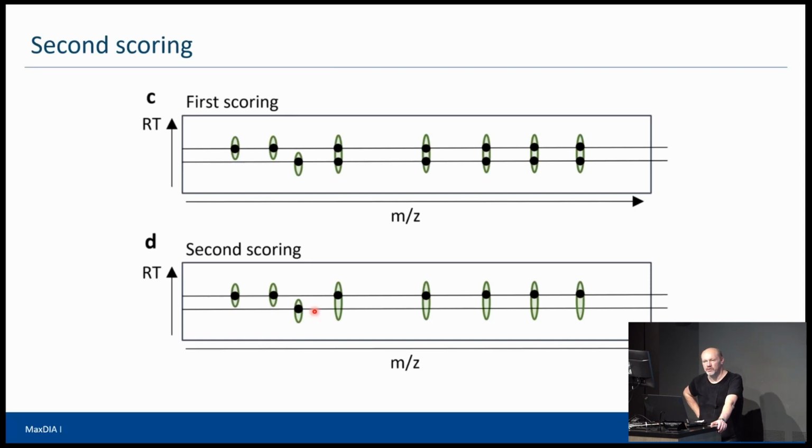you have to do to avoid overinterpretation, because if you don't, you would say, okay, I have identified both versions, the wild type and the SNP version, which you may not have because there was not enough evidence for the independent existence of the other one, right? And you only think there is evidence because you overinterpret the data by using the same feature twice, basically. And these kinds of things you can only do if you do this higher dimensional feature detection for your fragments, because otherwise you wouldn't even notice that this match and that match belong together, that they're going to the same peak.